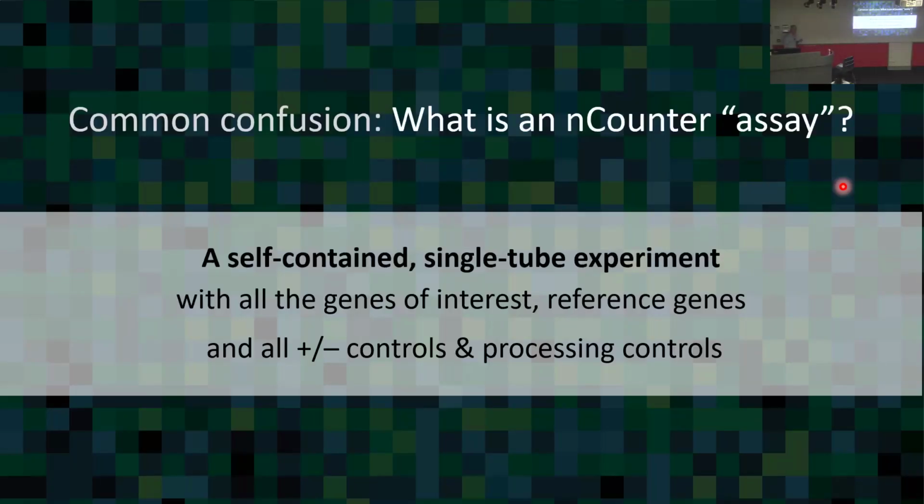So what do results look like? They're incredibly, incredibly boring, right? They're incredibly boring, but they're so good, right? So when I talk about this technology, everybody has the word assay in their head, and they think of the PCR when they think of an assay, which is one gene target or one control in one tube.